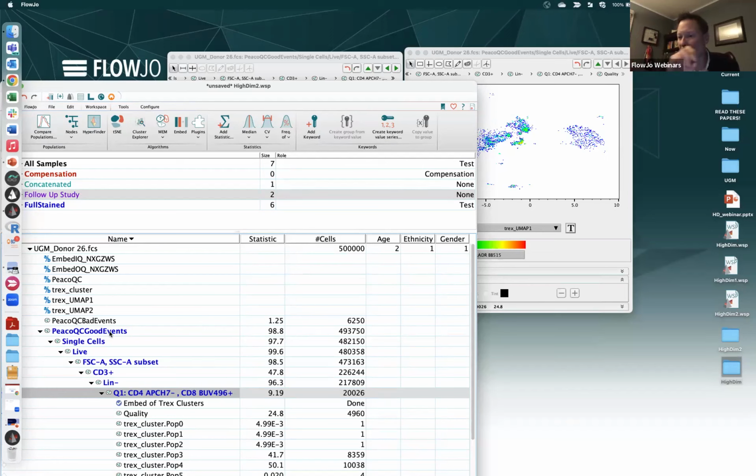That'll know what it is. It'll have a profile that anybody could talk about and say, well, it's high for that, low for that, compared to whatever my reference is. And then if we discover something of interest, we can use Embed to forward propagate it and make whatever discoveries we have actionable so that we can actually make this a foundational piece of some kind of future workflow toward identifying specific subsets or kinds of differences in whatever your perturbation is.